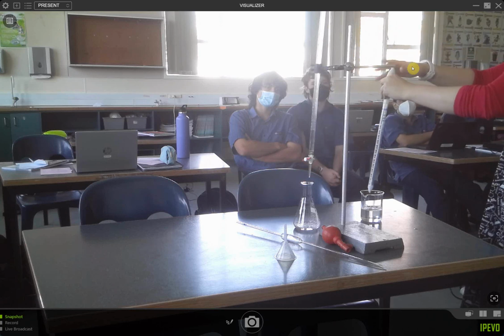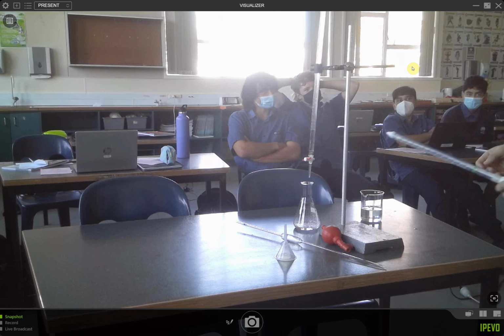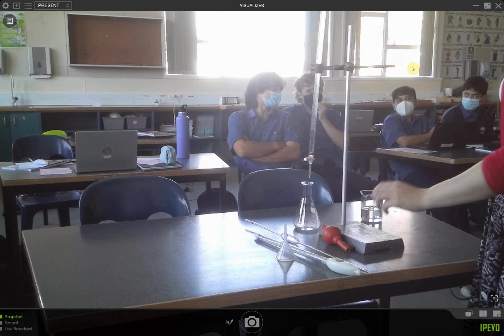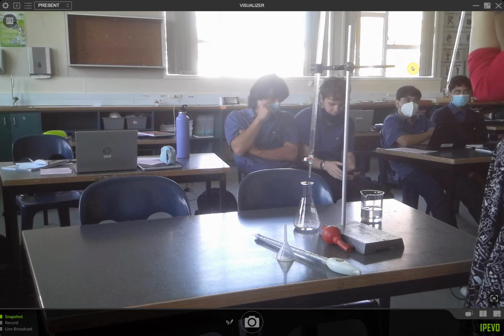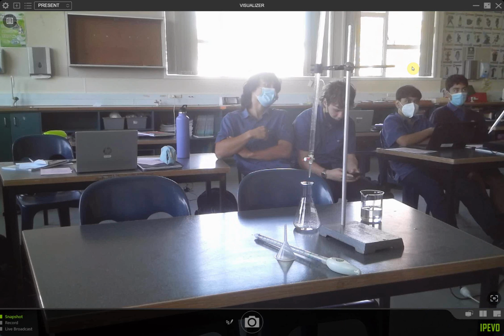I thought the meniscus was over. I'm not sure. I only heard meniscus as, oh, you think meniscus? Yeah, that's the little blob, because you know how water has polarity and clings to the side of the container, so it's going to cling a little bit to the side, and that's why you have a little blob on the bottom.